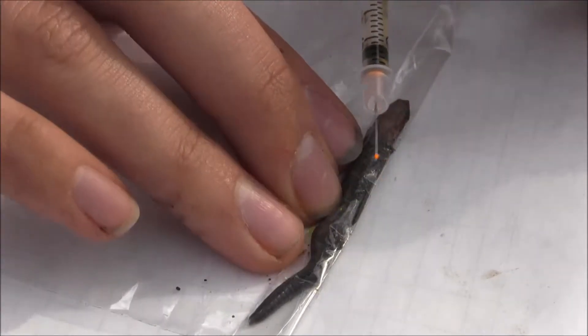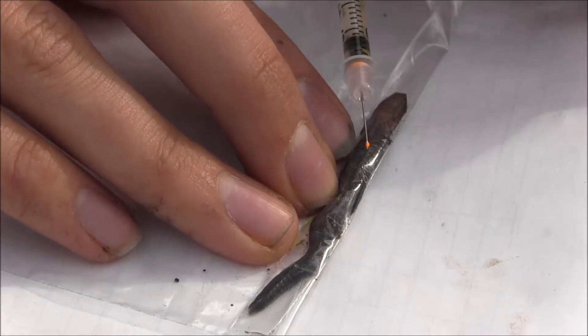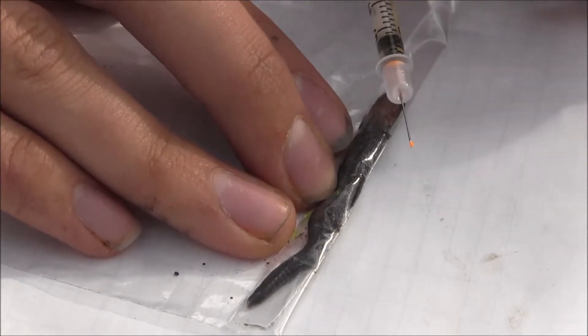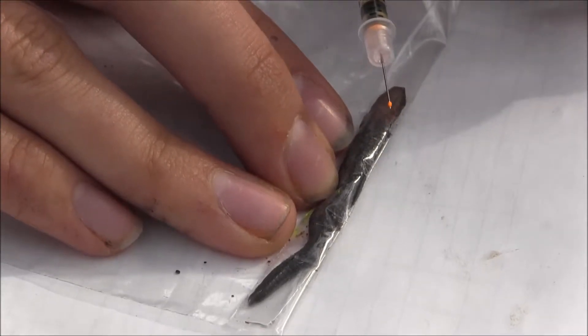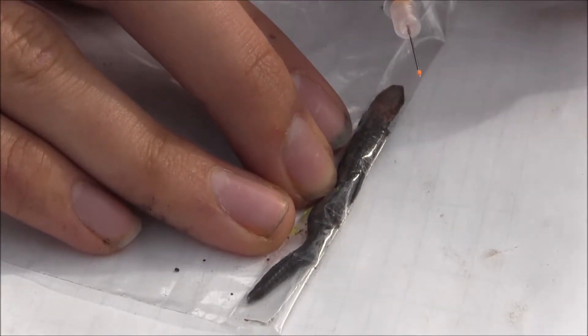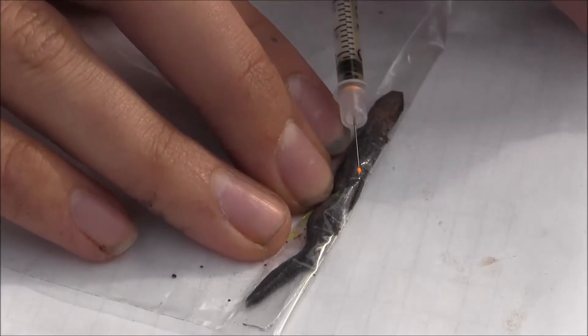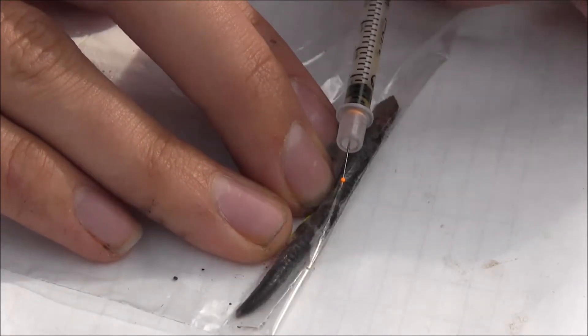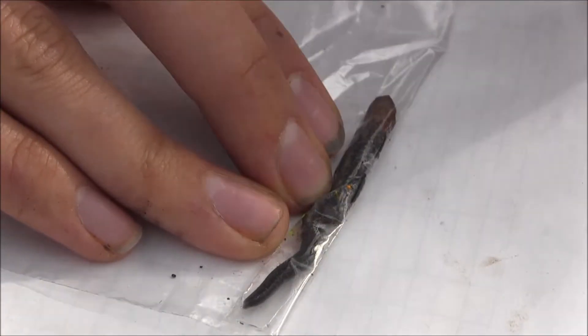So, you want to come in as parallel to the skin as possible. If the mark's too deep, it can migrate or break up and become hard to see. But if the mark's too shallow, you might not even be under the skin at all. So, come in here parallel to the skin. Gently apply pressure.